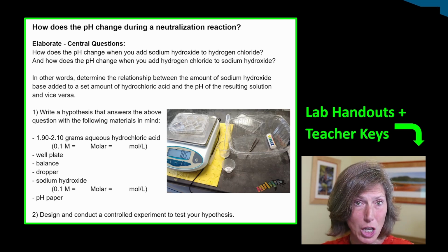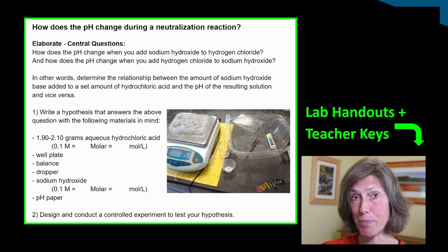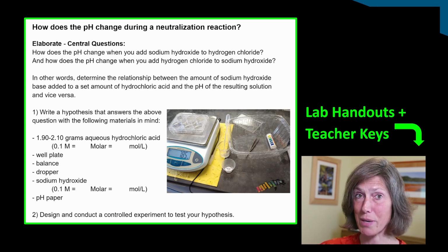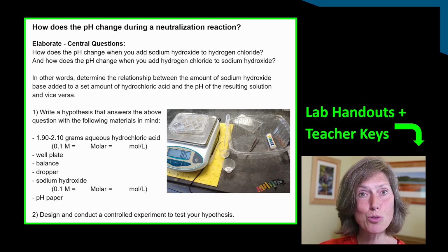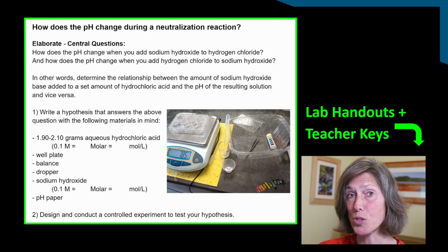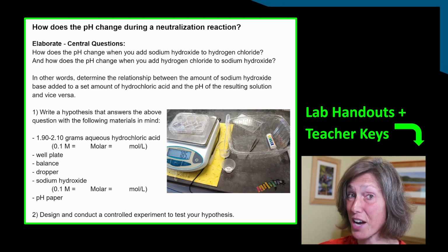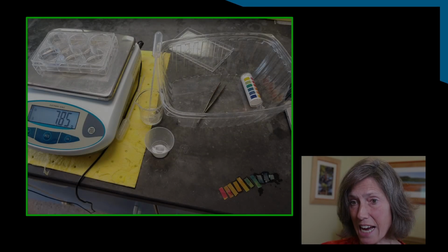How can we make that logical step from exploring acids and bases, then coaxing them to mix the acid and bases, which in essence is a neutralization reaction, and then to delve deeper and figure out how to determine the concentration of an unknown acid or base? Known acid, unknown in terms of concentration. So this image shows you how we did exactly that.